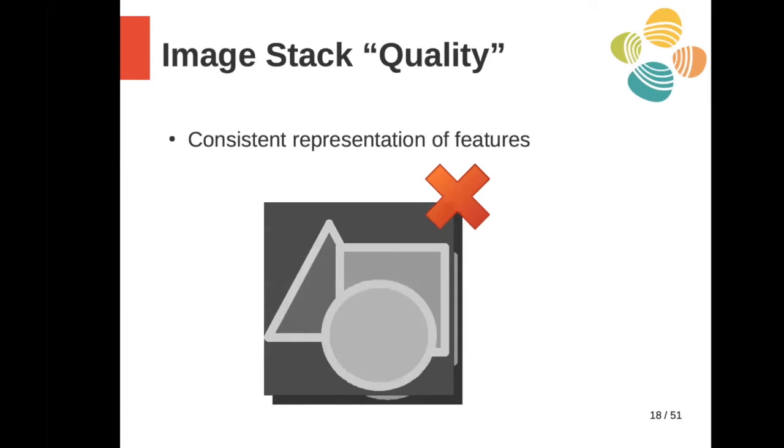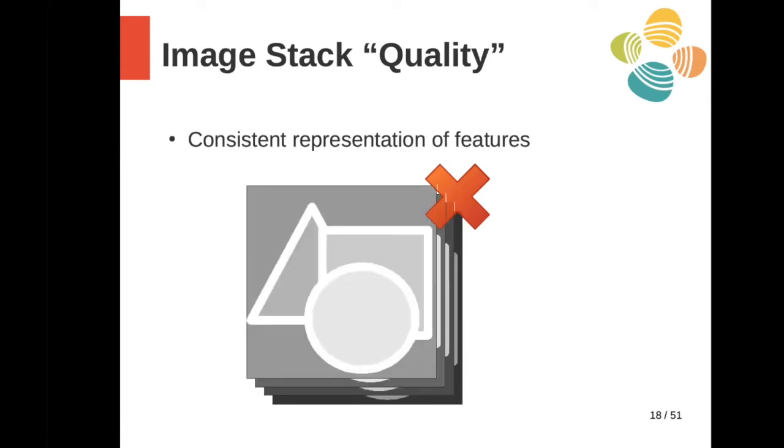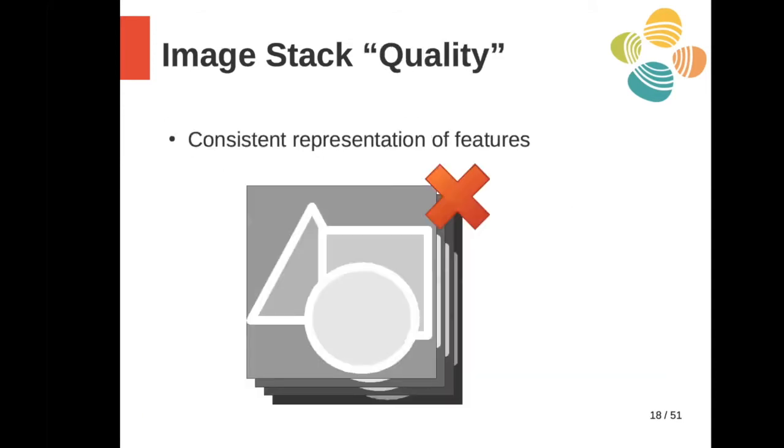So what might happen is that as this whole image gets darker, we might begin thinking that we're looking at background or triangle objects, because the triangle started out darker, right? So this is where normalization comes in and becomes important, especially localized normalization. And I believe tools like Avizo and Fiji or ImageJ provide these tools, and this may get covered in the next section.